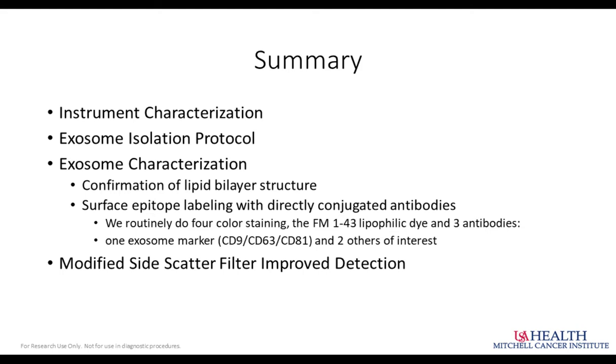We've done time tests. The blood sat at 30 minutes, an hour, and 4 hours with or without protease inhibitors. And we do see a strong loss of surface markers on the exosomes if we don't have those protease inhibitors in there. I probably should have mentioned that in the main part of the webinar. It's very important to have those in there to help preserve the structure of the exosomes.